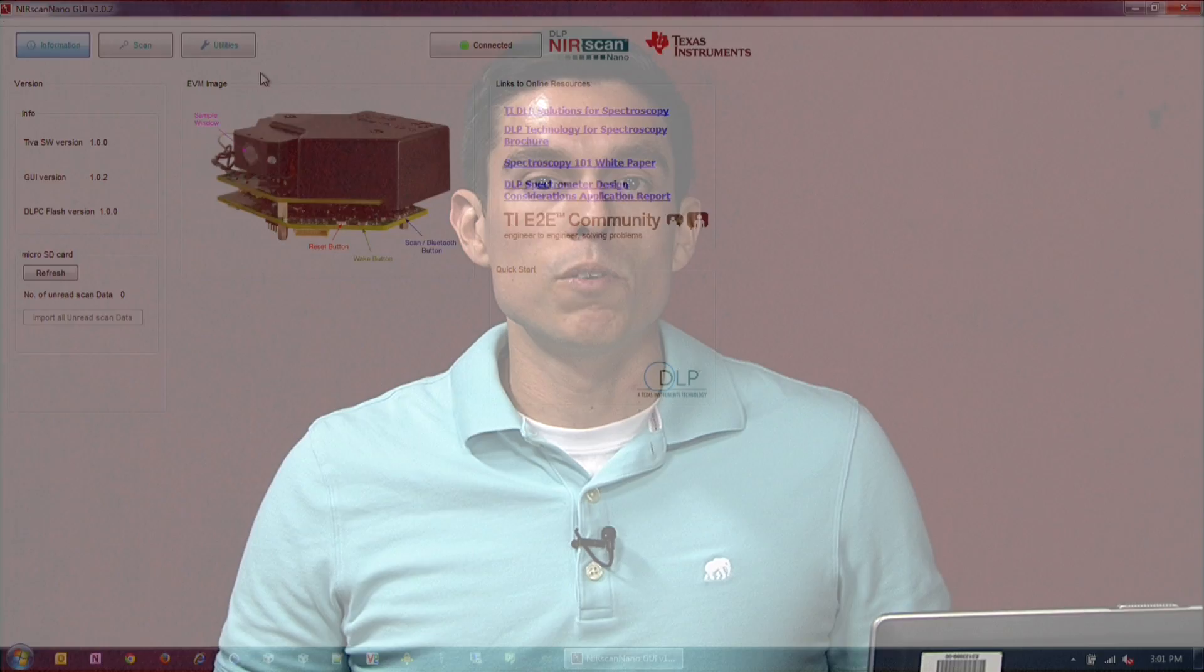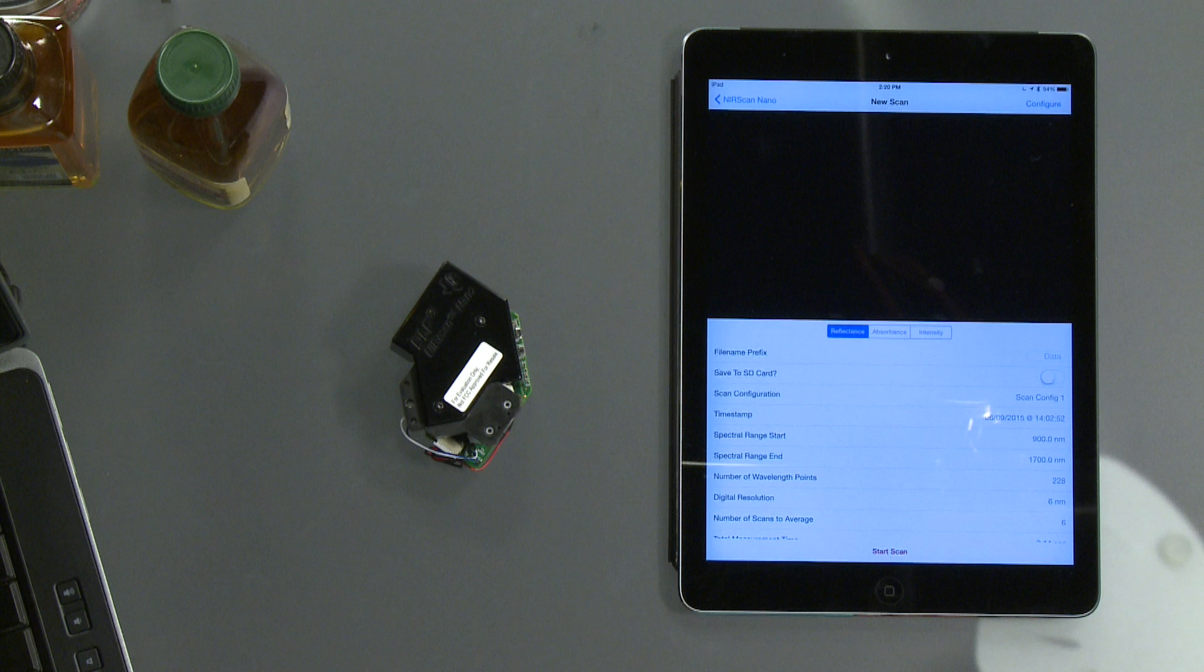For Bluetooth connection, use the iOS app to enable the same GUI features like taking scans, downloading and displaying data, and changing the system parameters. Refer to the user's guide for battery specifications for a complete wireless option.